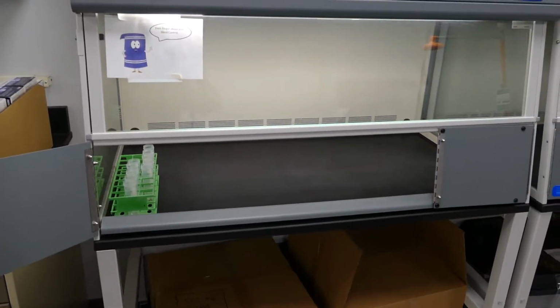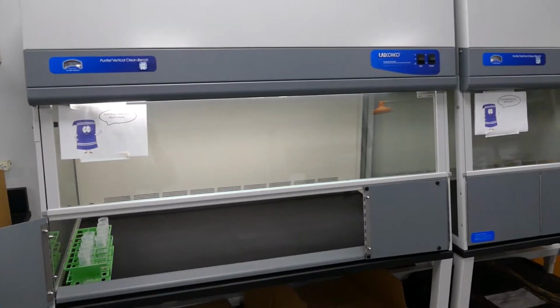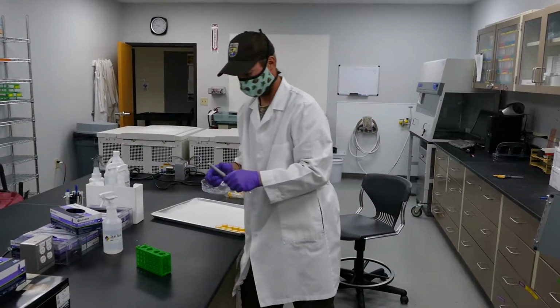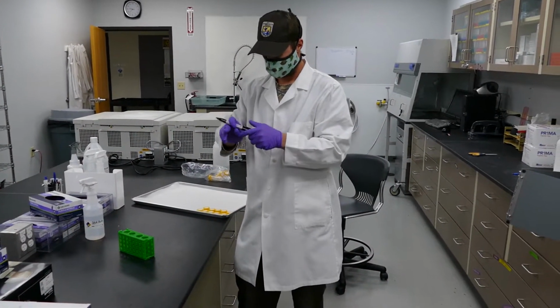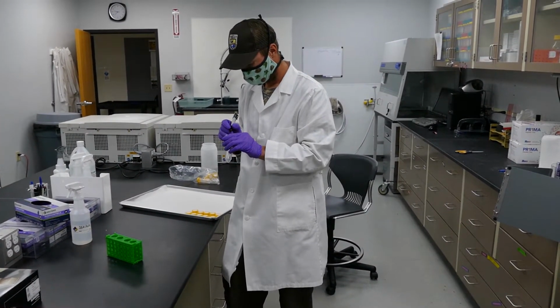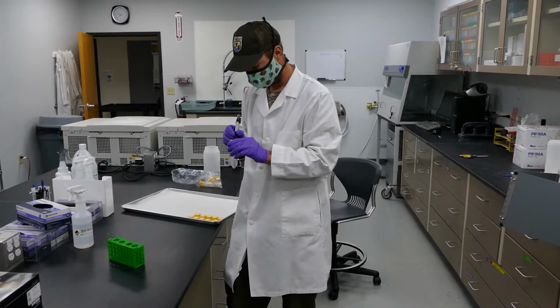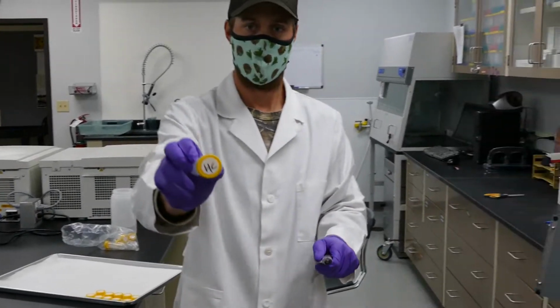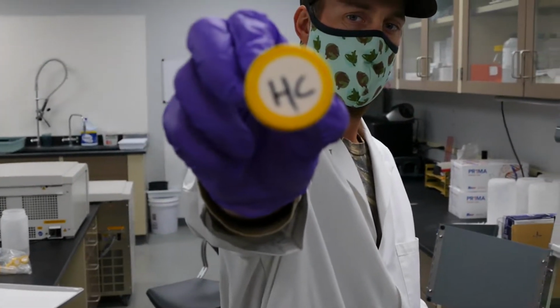There should be at least one hood control for each case, and if an individual case is spread between multiple hoods, there must be one hood control per hood to ensure sample integrity throughout subsequent processes. Bottom line, if you put any samples in a drying hood, they must be accompanied by a hood control tube.